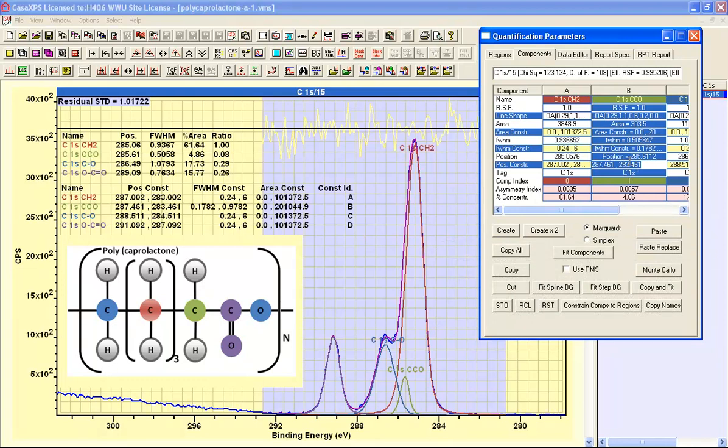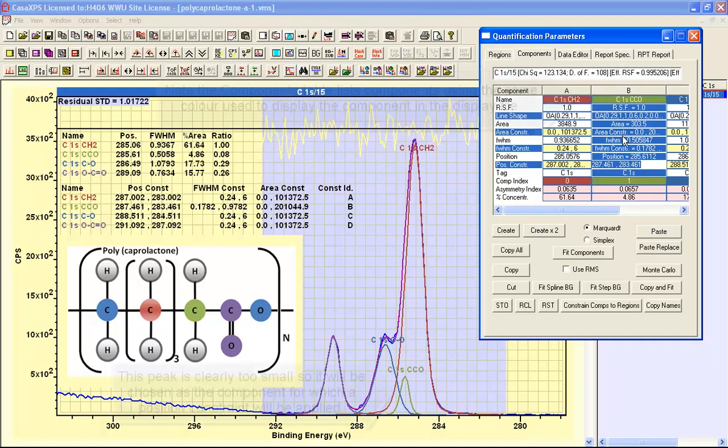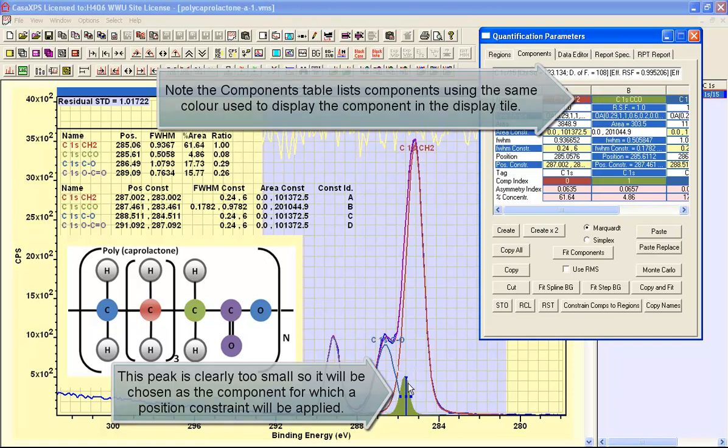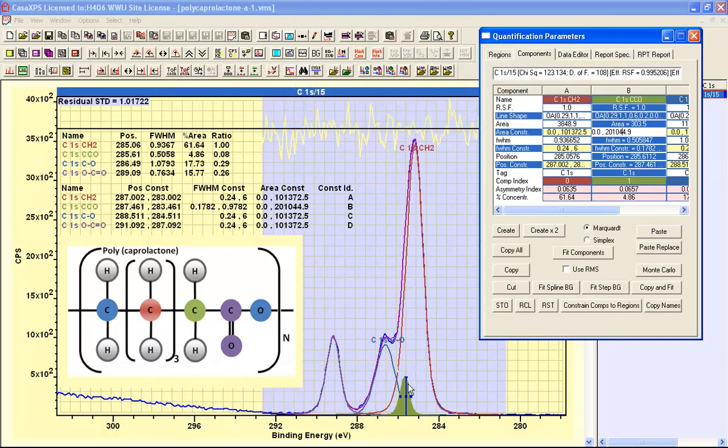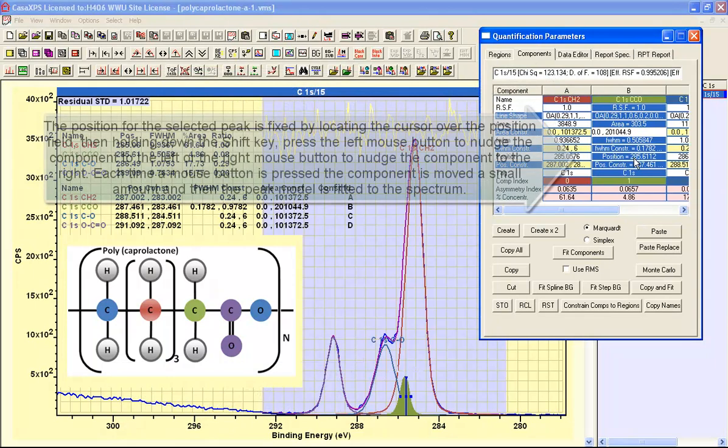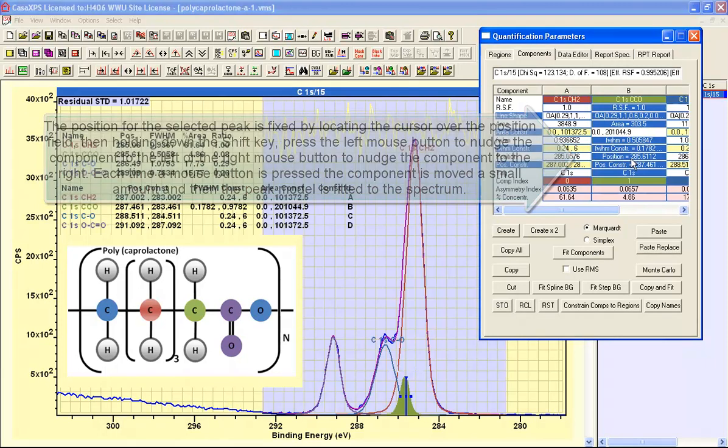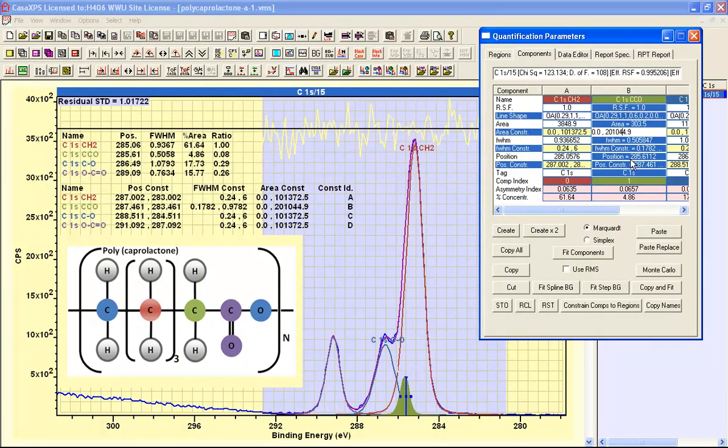I'm going to highlight this peak here as the one that clearly stands out as being lower intensity than you'd expect. I'm going to do some adjustments to the peak position for this one peak by fixing its position and refitting the other data each time I produce a new position.